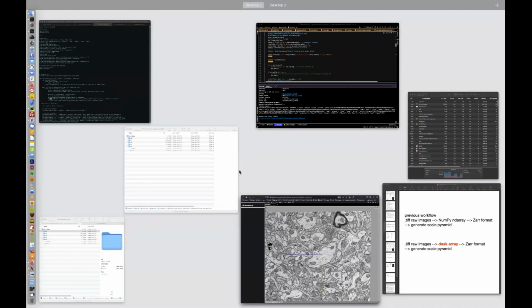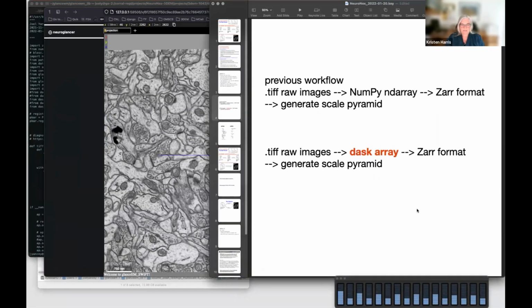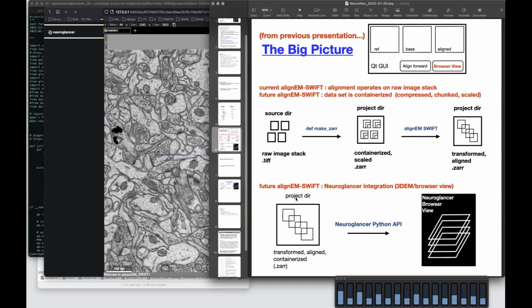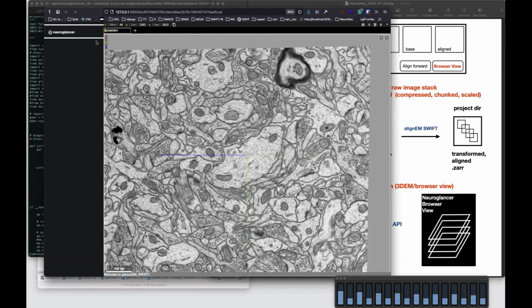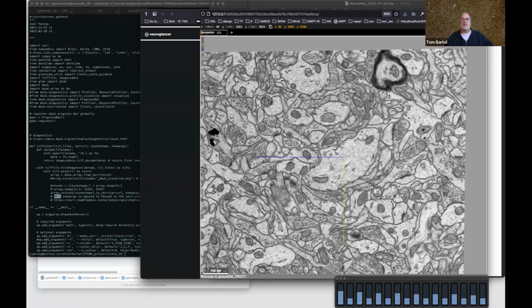I think this is really cool. We just did a space bar in Reconstruct, and you can blend it and unblend it, and it's extremely useful for knowing whether or not you're following the right structure or if it's ended. Yeah, I mean, you could do something like that with callbacks, for example, right? You could just have that function bound to a key, so whenever you press it, it executes it. I showed Joel and Tom some examples of that. You could also have it as a GUI function if you extend the front end.